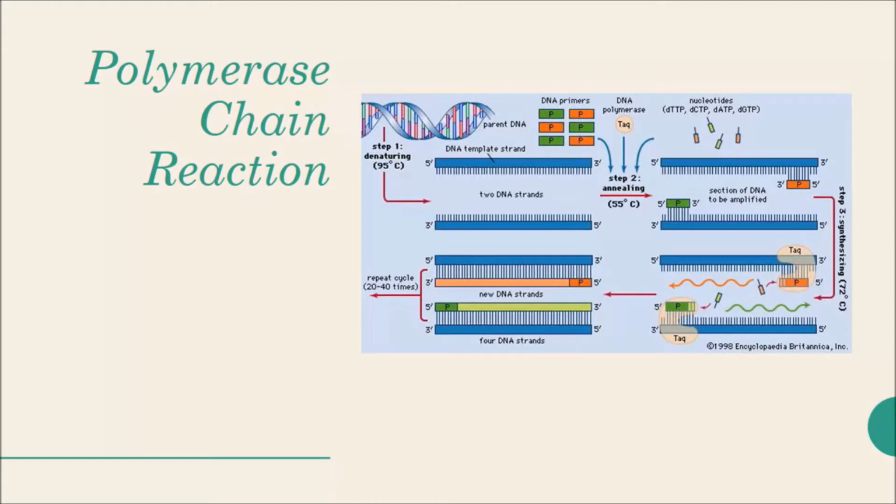So now that we know what the modification is, how do we detect it? I tested for genetic modification using a polymerase chain reaction, which detects a chosen section of DNA using a specific primer set. That DNA section is then copied over and over by DNA polymerase, amplifying the wanted section. After the PCR is complete, that section can be detected using gel electrophoresis.